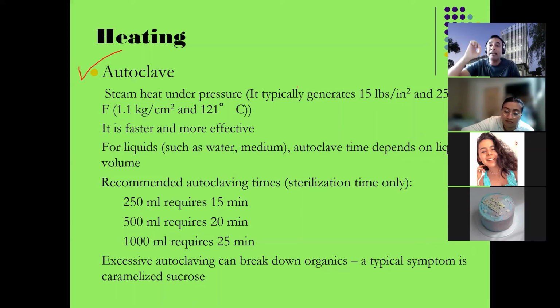That is why the pressure combined with the water and temperature creates pressure with the steam that is deadly. Within seconds, it is going to enter any living cell inside that environment, with the temperature, pressure and steam, and it will get everything. So that is the main principle of the autoclave.